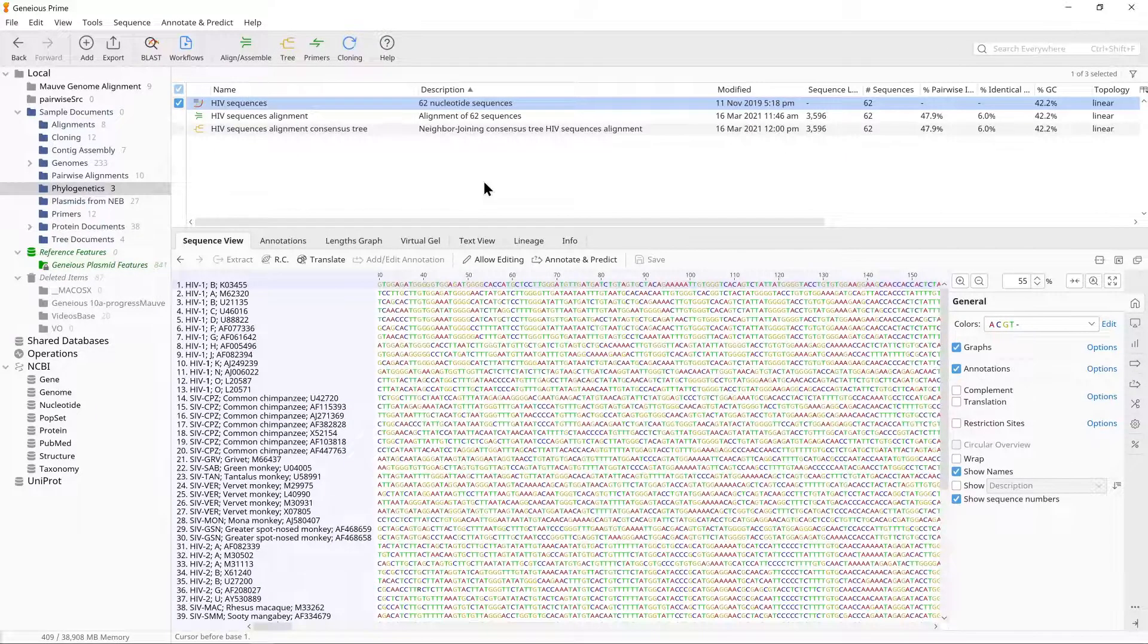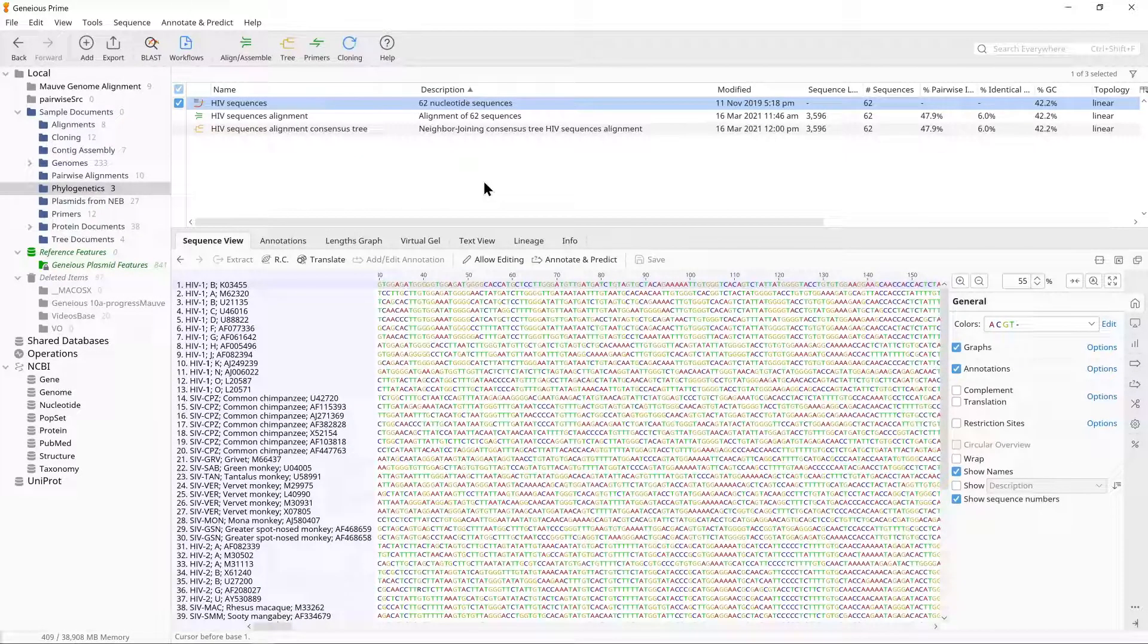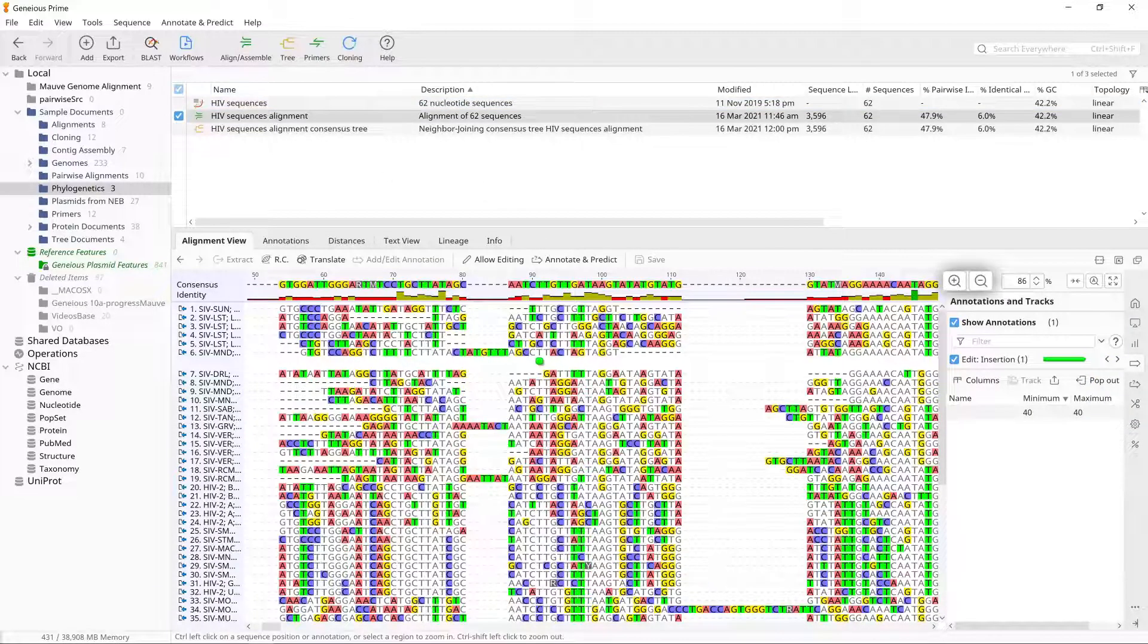It may take several minutes to complete. Once the alignment has completed, click on it to view it and zoom in to see the bases.